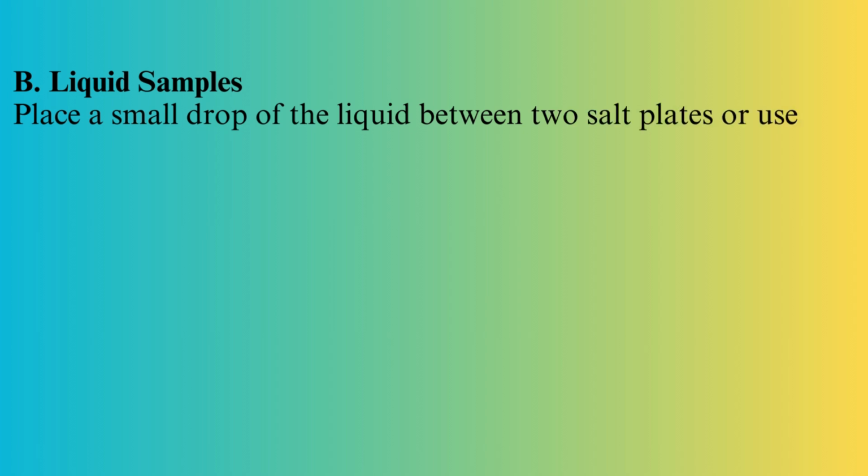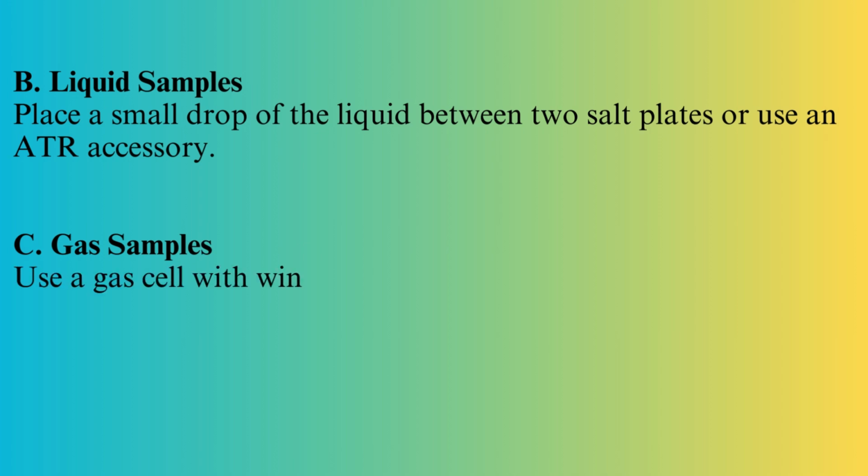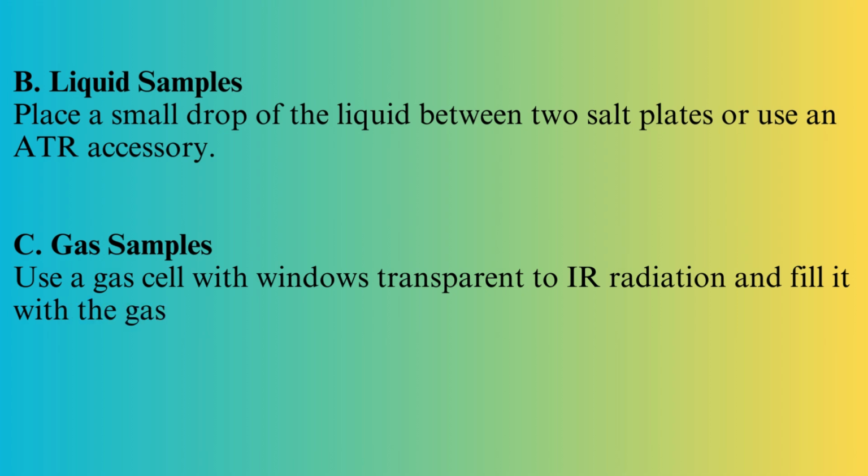Liquid samples: place a small drop of the liquid between two salt plates or use an ATR accessory. Gas samples: use a gas cell with windows transparent to IR radiation and fill it with the gas sample.